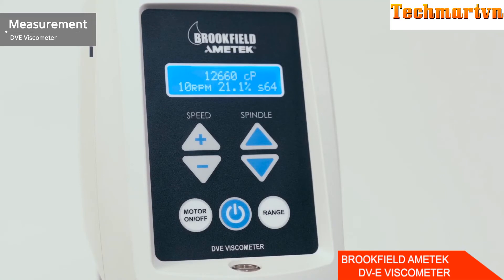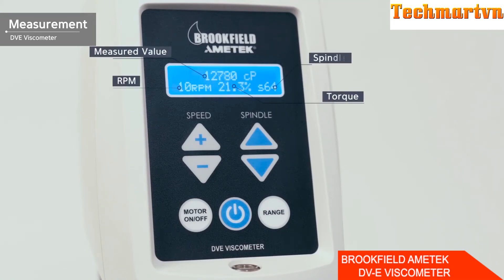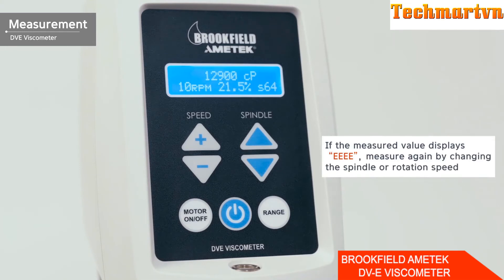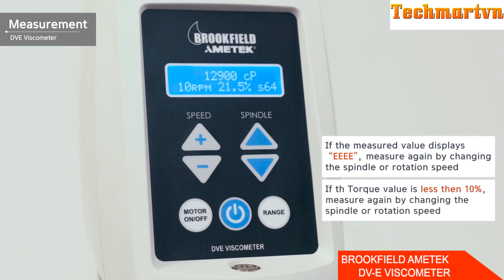The display shows four figures, each representing the measured value, RPM, torque, and spindle number. After a certain period of time, the measurements stabilize and the results can be checked. If the measurement is not displayed and 'EEE' is shown, it means the value has gone beyond the measurement range — change the RPM first, then replace with a different spindle if needed. If the torque value is less than 10% when the measured value is stabilized, measure again by changing the spindle or rotational speed.